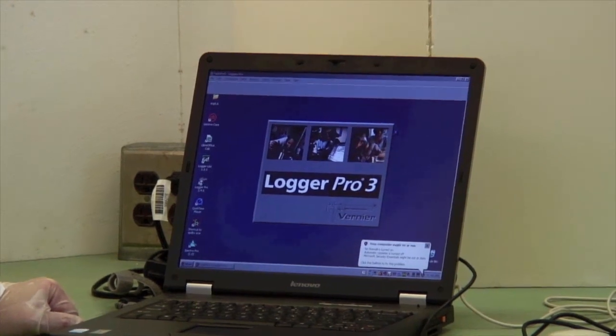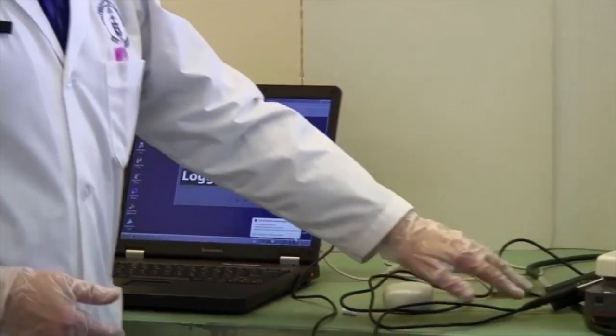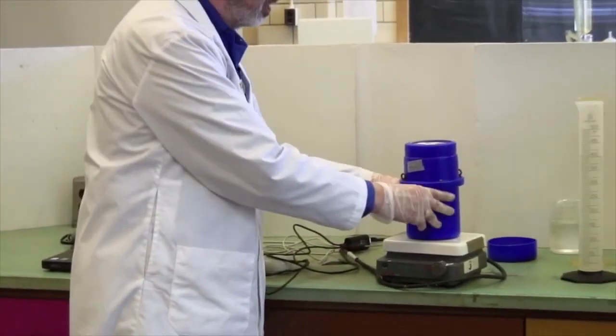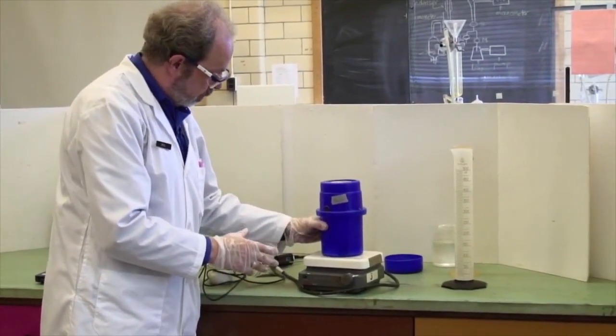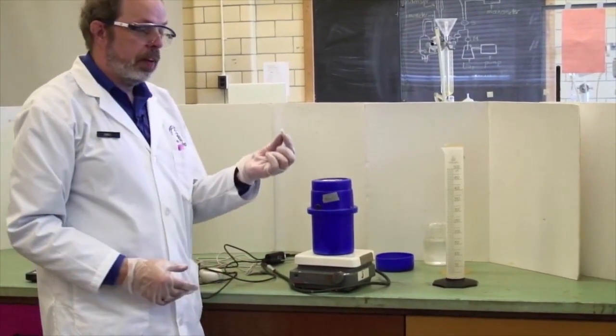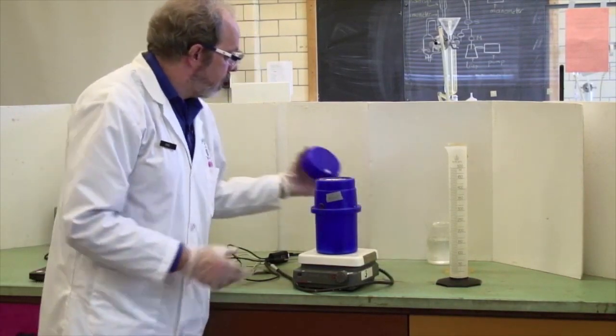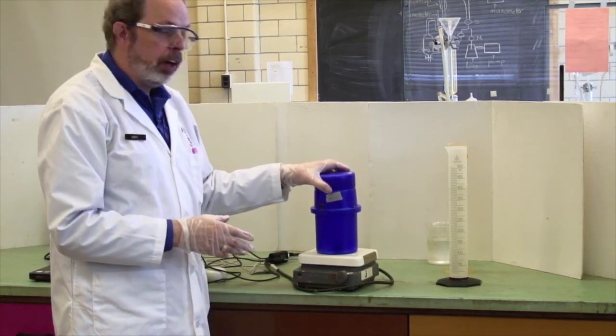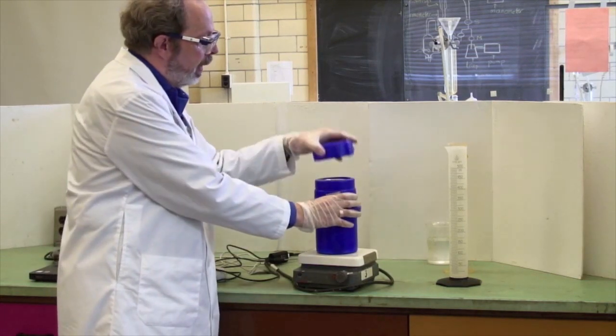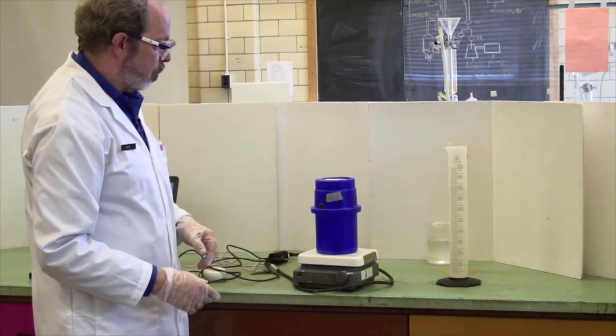While we're waiting for that, let's talk about the calorimeter itself. The calorimeter is just a Dewar flask. You should have a magnetic stir bar inside it and when it's actually operating we put a lid on it so that there's minimal heat loss to the environment.